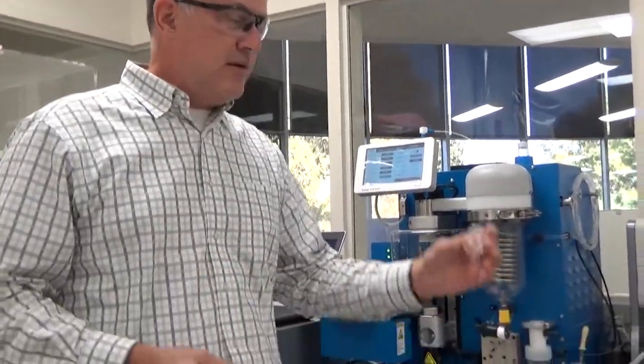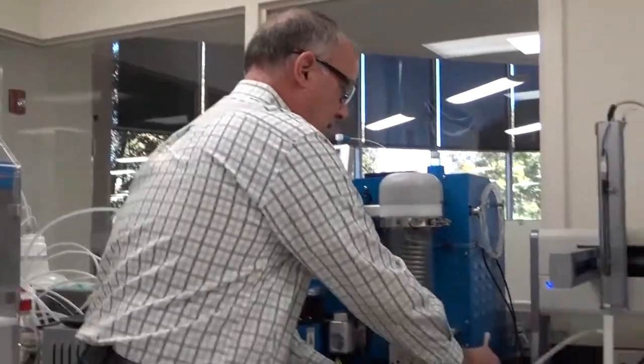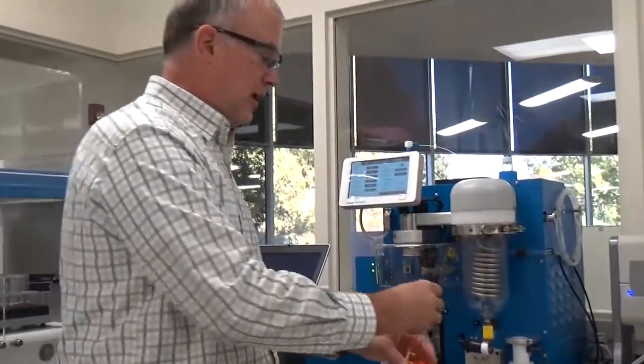So what I want to do is show all the different ways you can introduce samples into a V10 touch. The most basic way is you just take a vial, you put your reaction products in it.